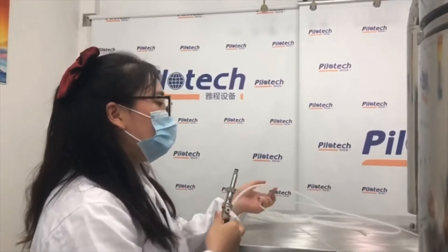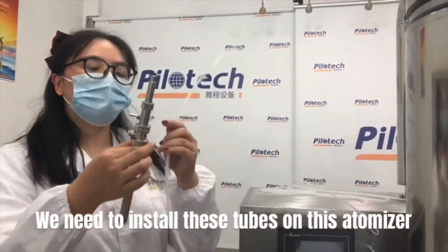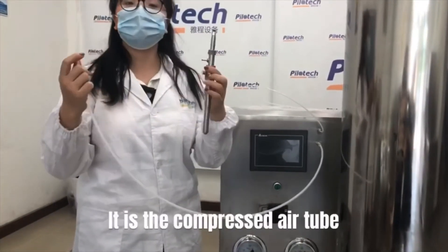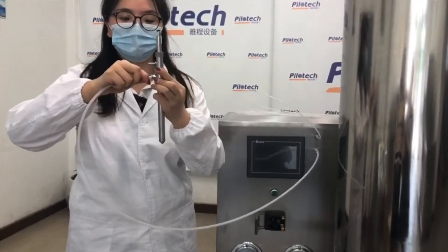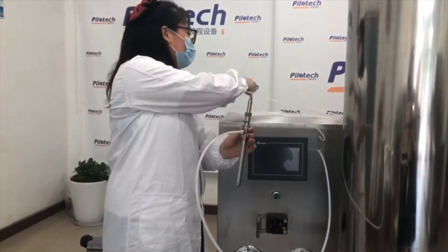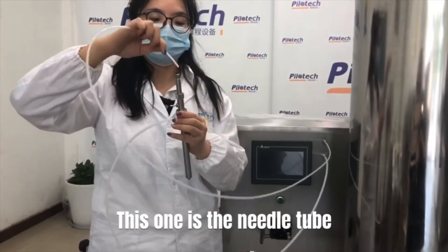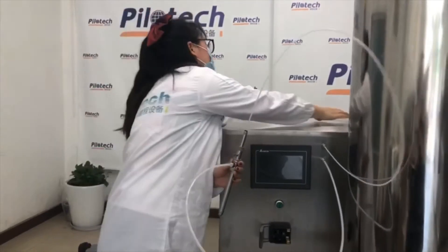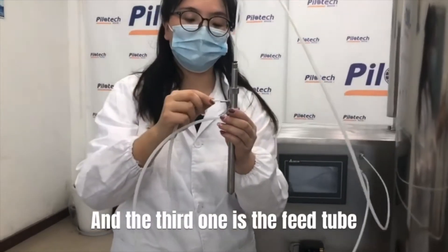This one is the atomizer. We need to install these tubes on this atomizer. It is a compressed air tube. This one is the needle tube. And the third one is the feed tube.